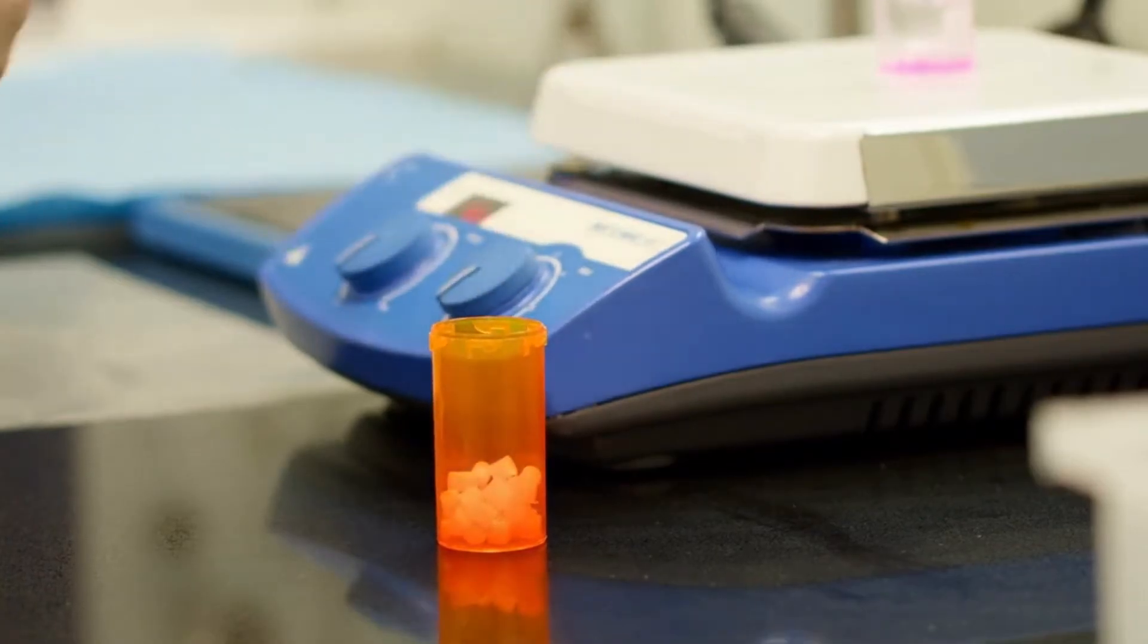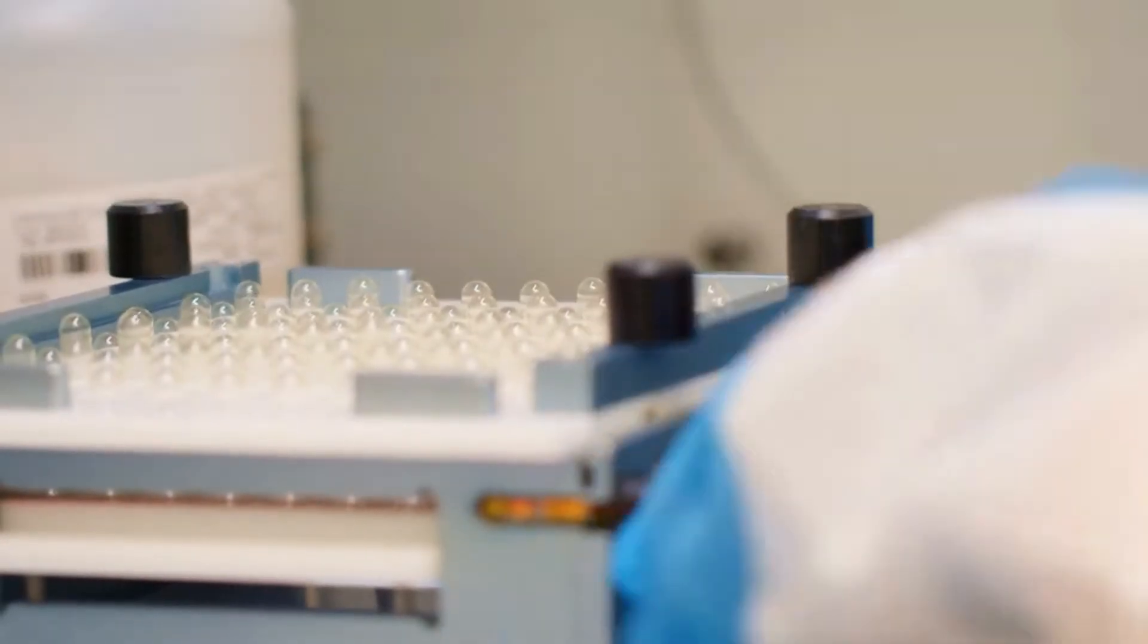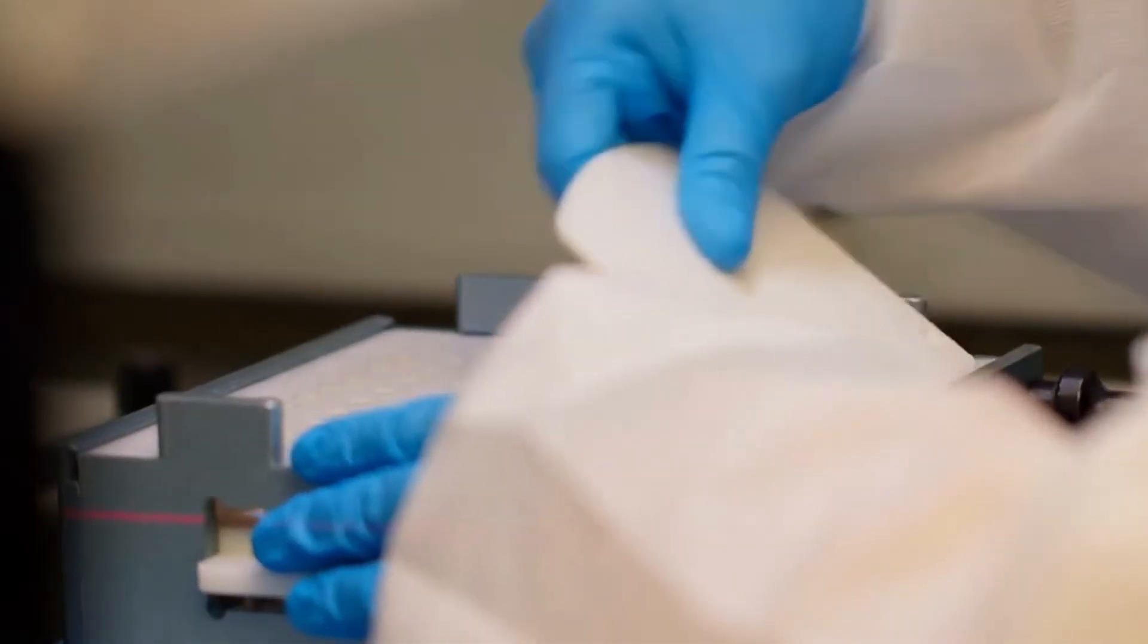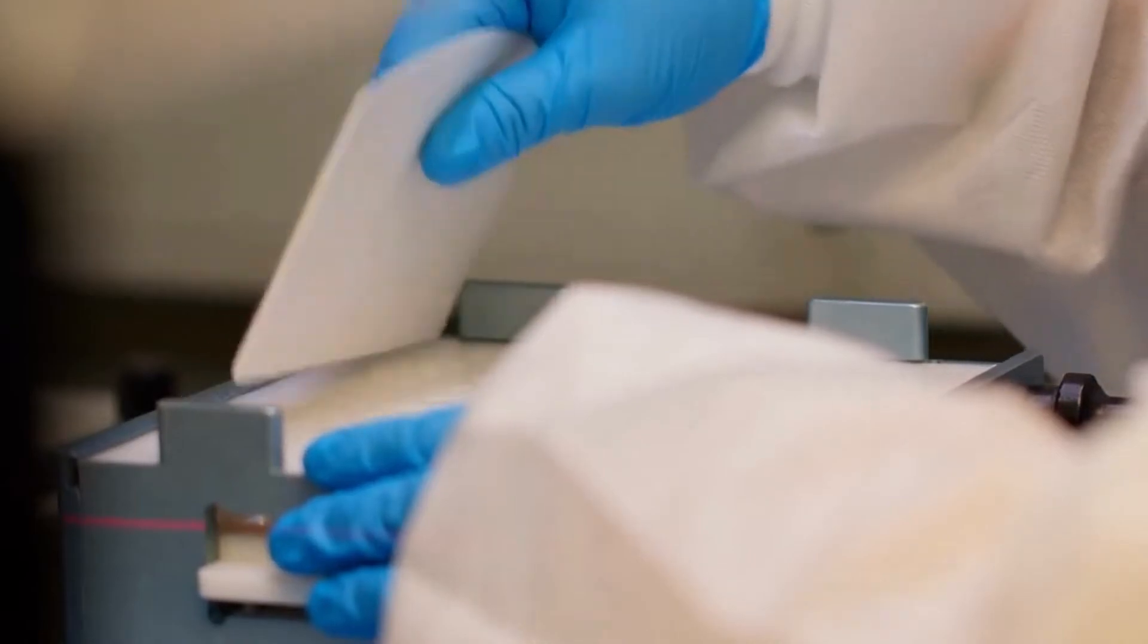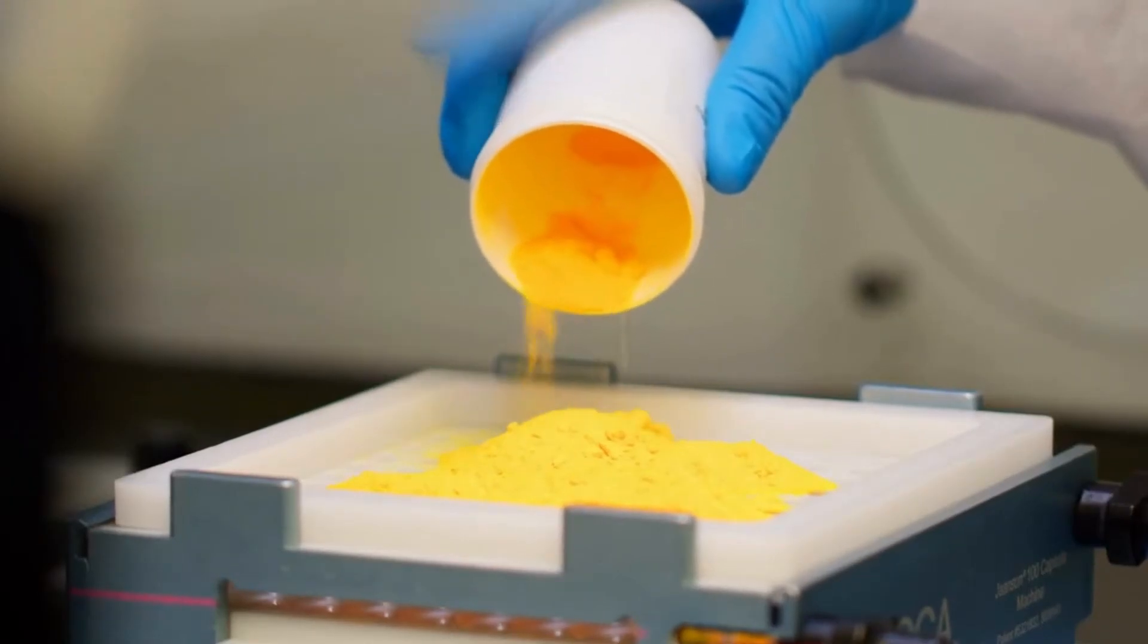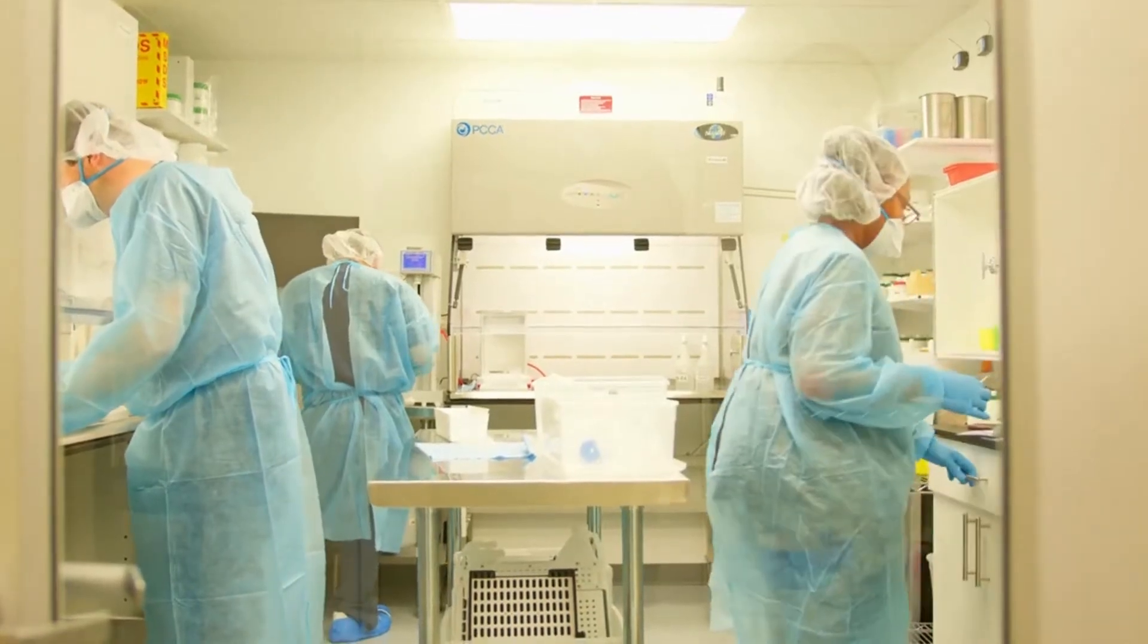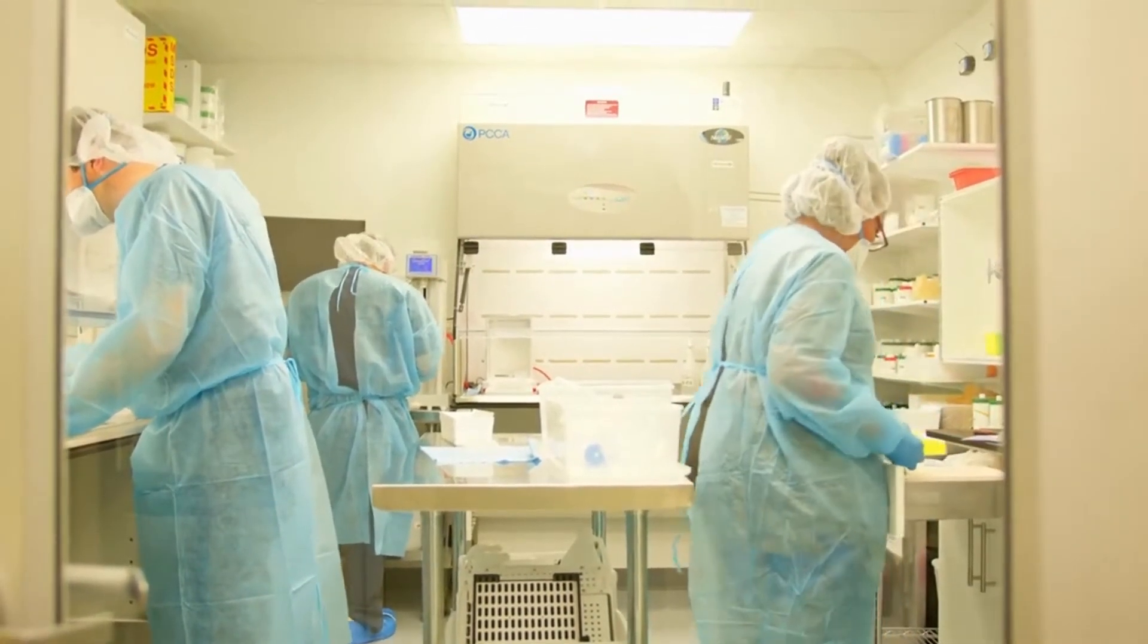We focus exclusively on compounding, which is what we do all day, every day, giving us the experience and knowledge to be the best. Our pharmacists and technicians have had extensive training beyond pharmacy school, as well as years of clinical experience. At Town & Country Compounding, our staff members are true compounding experts.